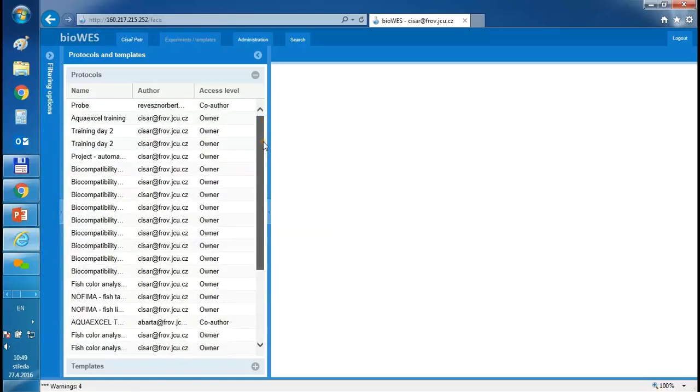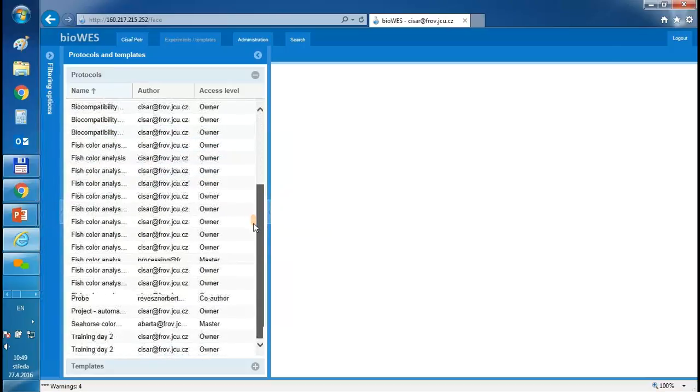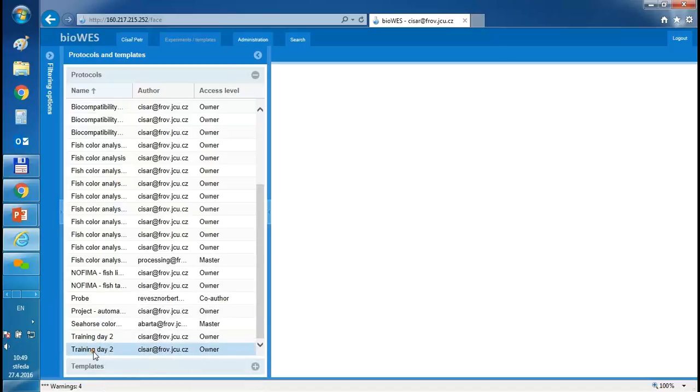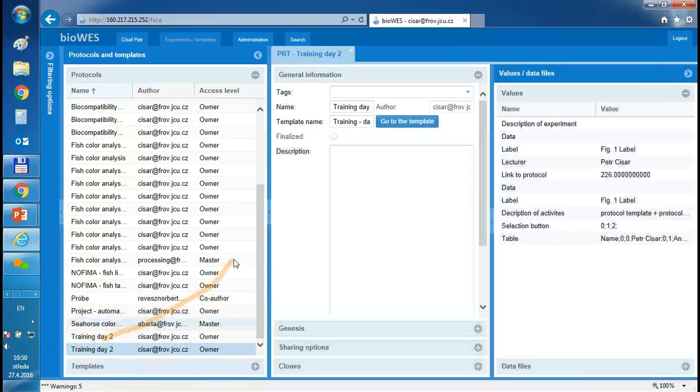Because I created the new protocol, I will sort it by name. I created a new protocol, which we called Training Day. I double click on the protocol, and it should appear in my list. Okay, it's there.